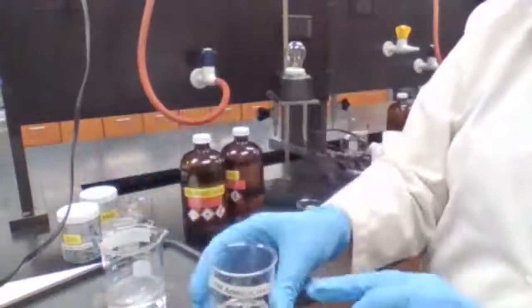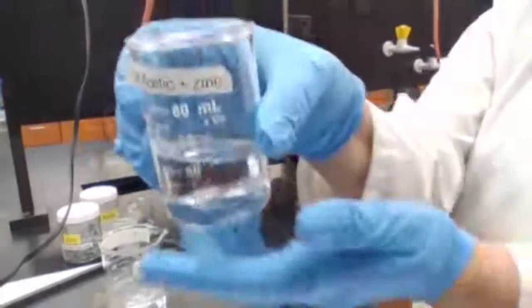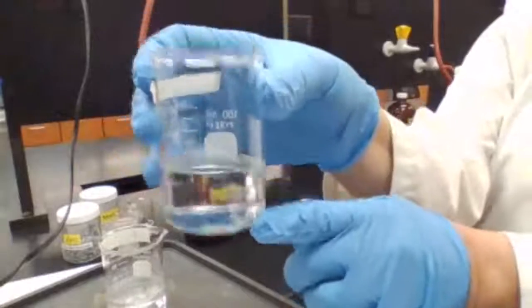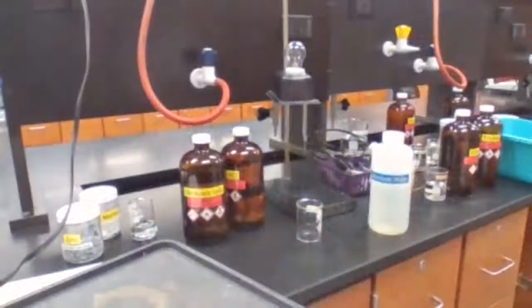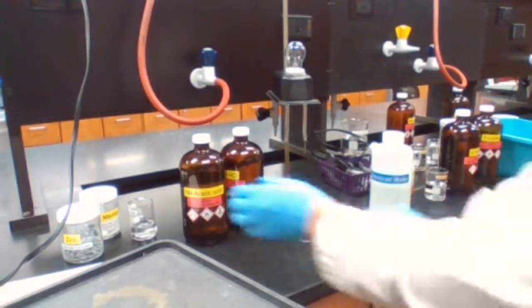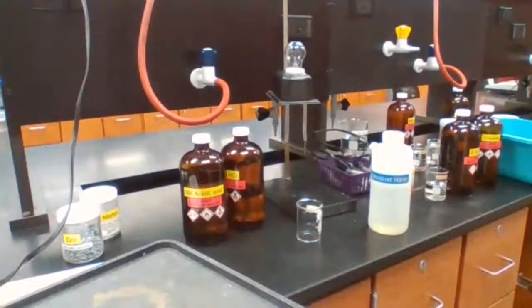And this one is the acetic acid and the zinc, with not much activity. So this makes the difference between strong and weak acid. I'm going to transfer it to the fume hood so I don't get too much hydrogen gas in my face, especially since these are strong acids at high concentration. Leave it, put it away.